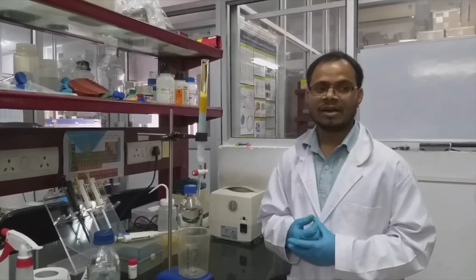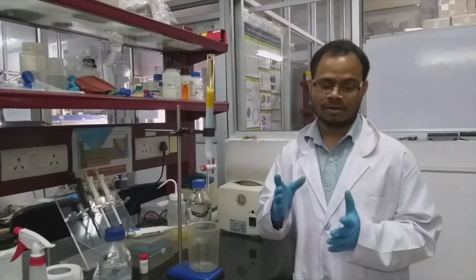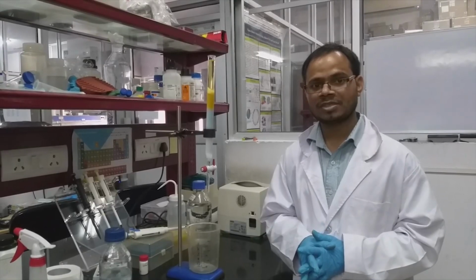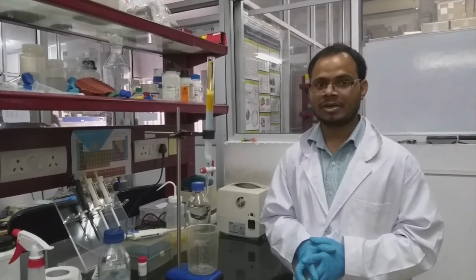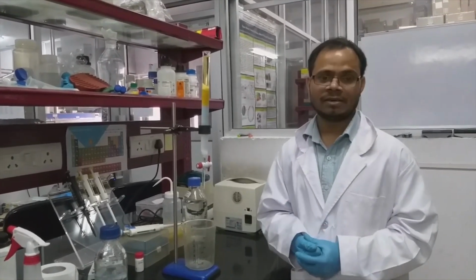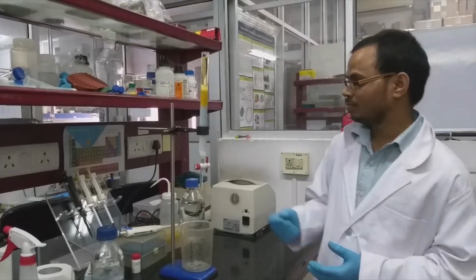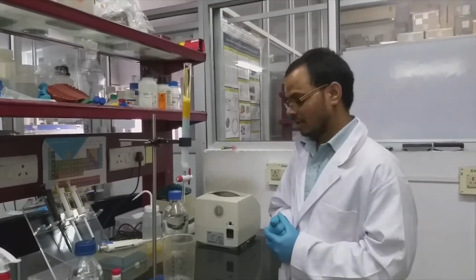So what you have to do is collect all the fractions, and you can verify through polyacrylamide gel electrophoresis, or you can check the UV-visible spectrometer based on the protein absorption spectra. So we can clearly see it is eluting out.